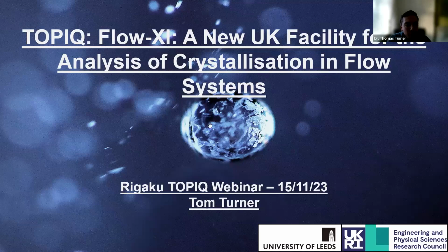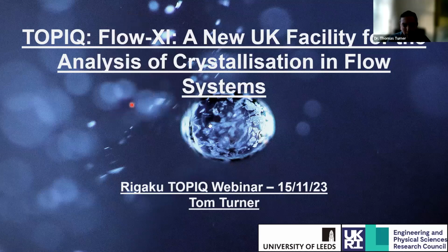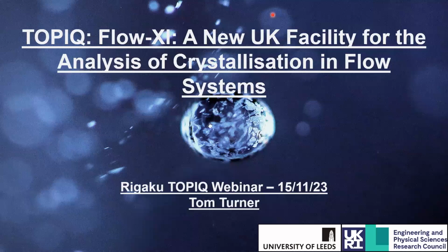Thank you for inviting me to give this webinar on FlowXl and the new facility that we've been building at Leeds. I want to go through what FlowXl is, what the facility is, give some background on flow crystallization, and also some background on the commissioning experiments that we've been developing over the last couple of years at Leeds.